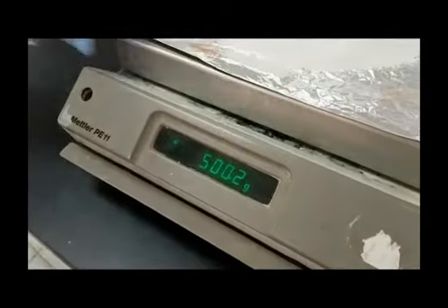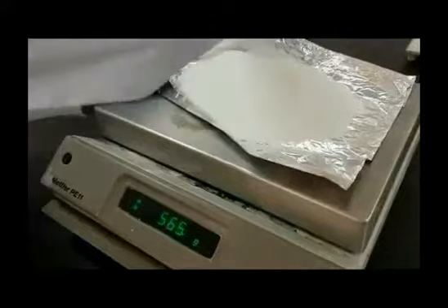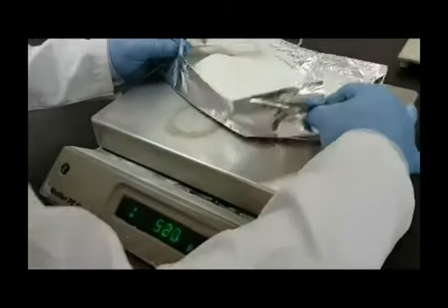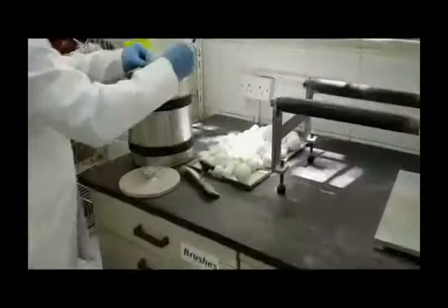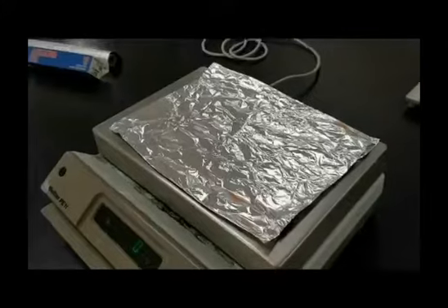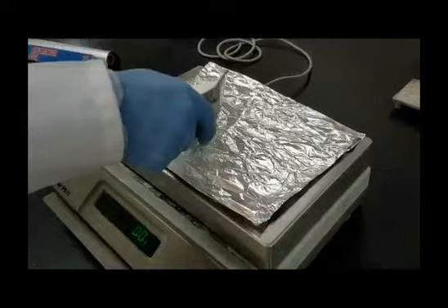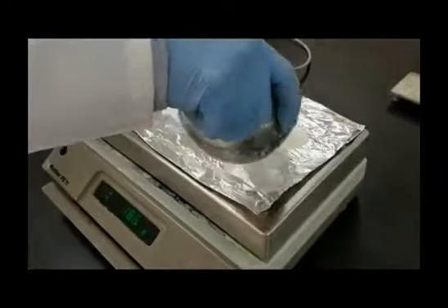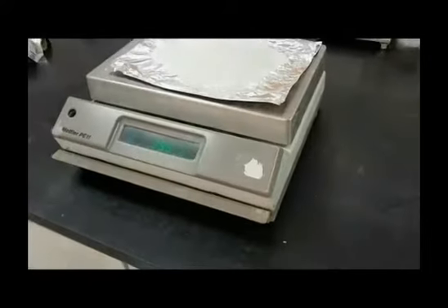As you can see, we are weighing one kilogram of coarse sucrose. This amount is being weighed into two portions, each of 500 grams. After doing so, place it in the milling chamber of the bowl mill.